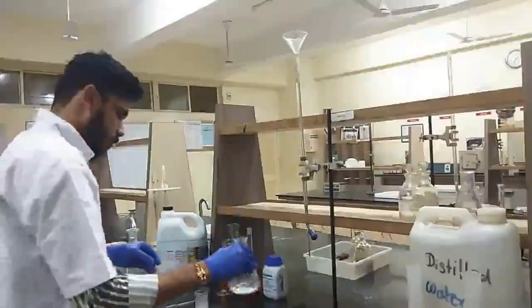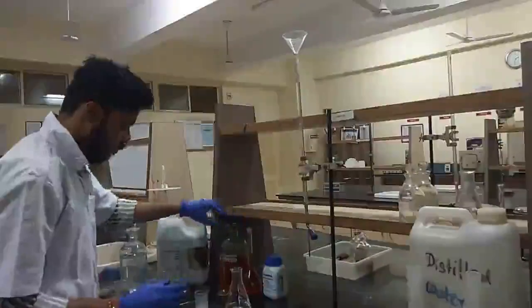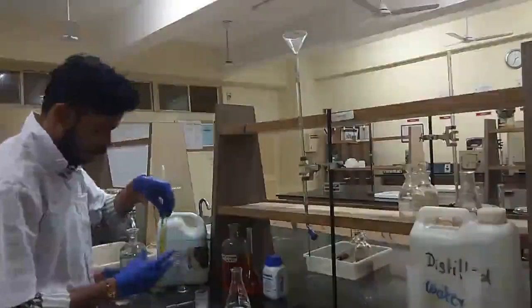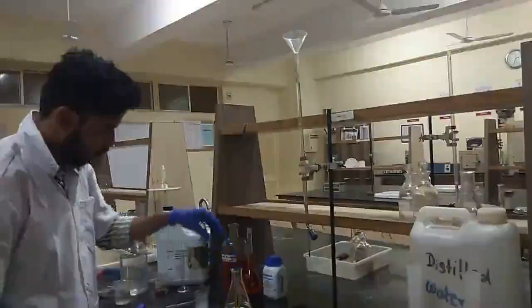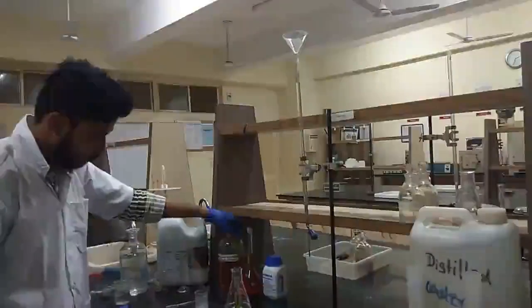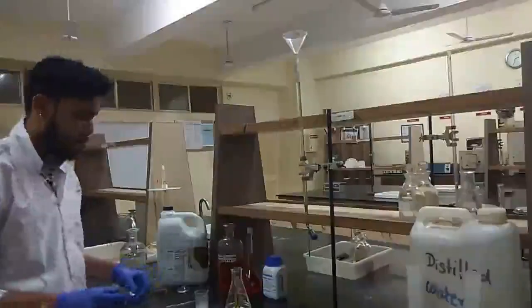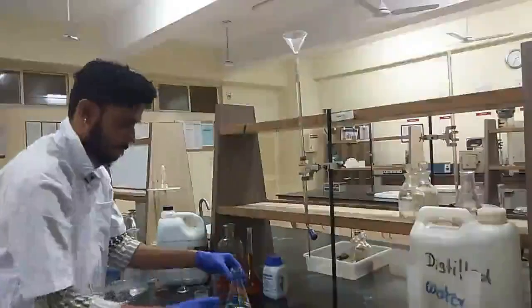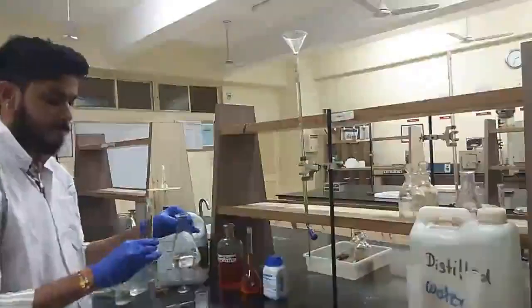After this, we require 10 ml of 0.025 normal K2Cr2O7. So normally we prepare 0.25 normal K2Cr2O7, and similarly we'll be diluting it more to 0.025 normal K2Cr2O7 by taking 1 ml of 0.25 normal K2Cr2O7 and adding 9 ml of distilled water to it.